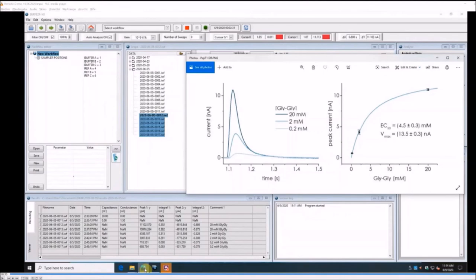So with this specific activation cycle that we apply for the NCX measurement, nothing else became active. It's because we don't have the membrane potential, because we don't have any other cofactors or ions that might be necessary for other transporters or channels to be active. So it might happen that in some assays, other transporters or channels in the background show also activity, but that happens actually very rarely because most assays are specific in their activation cycle. And we proved that with inhibition experiments, for example, with SEA0400, which is one of the more specific NCX blockers, we could show that there is actually no active background in our assay, which was very nice.